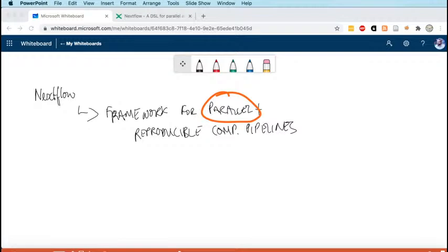With a system like Nextflow, those three things are completely interchangeable. You just have to change one configuration option, and you can run the same script in those three different places in a trivial fashion. And that's apart from the parallelization, that's the other thing that you get with a system like Nextflow, which is actually really tricky to do if you're writing bash scripts.